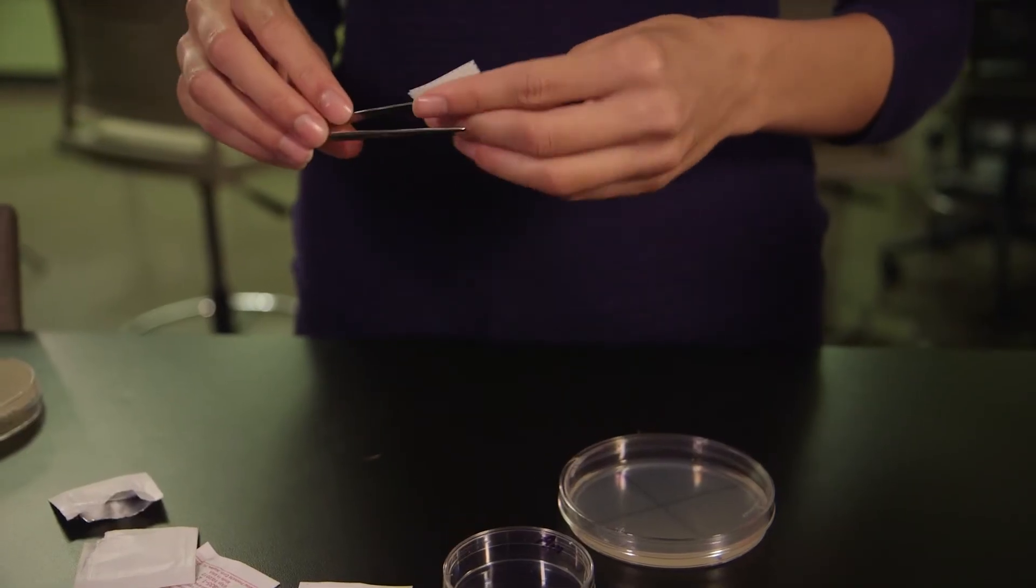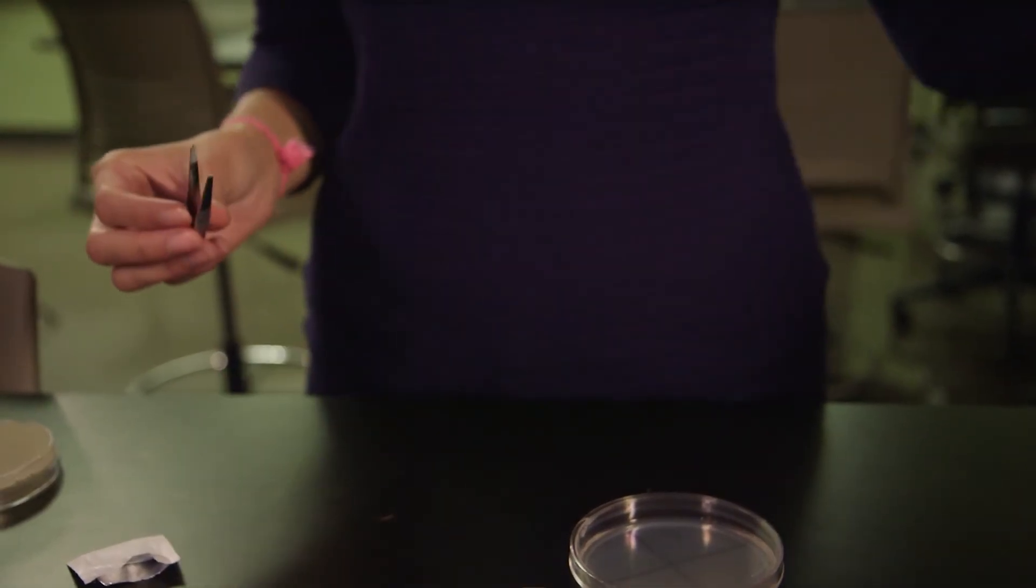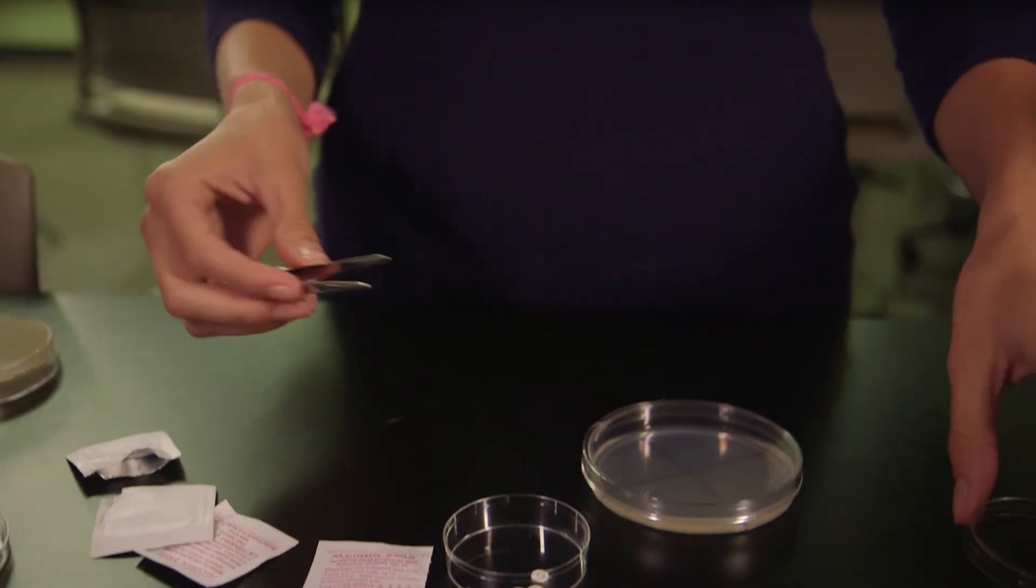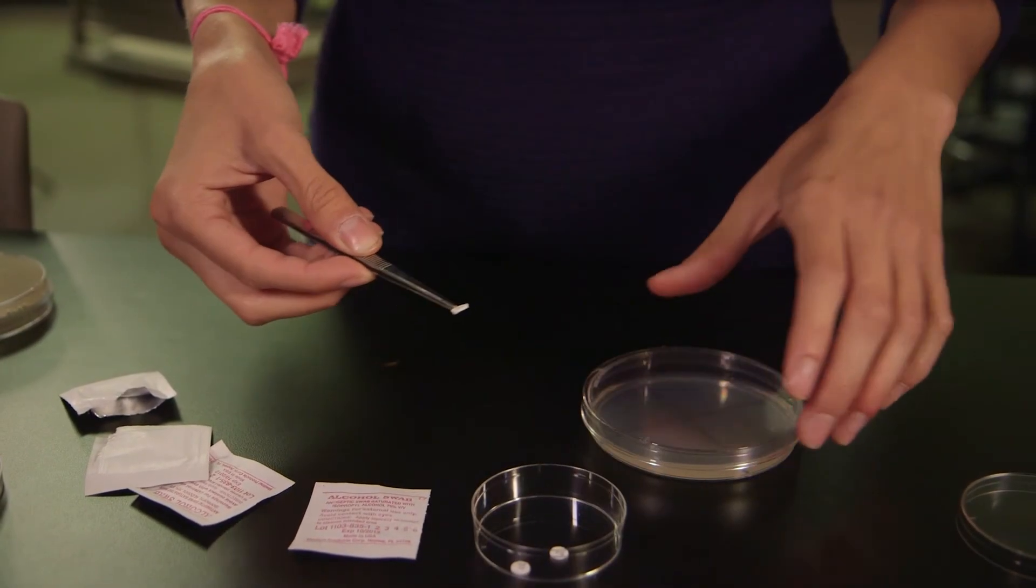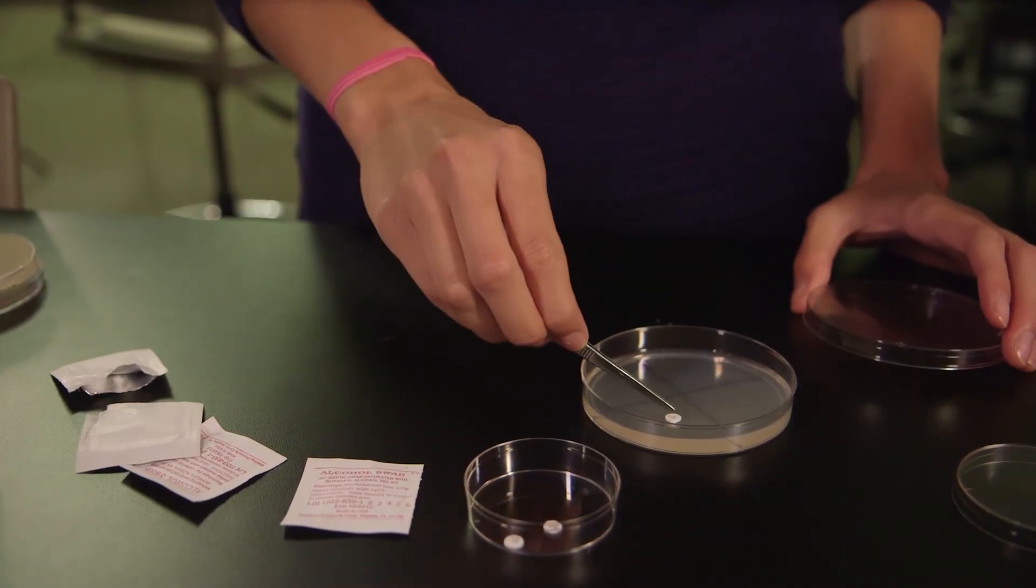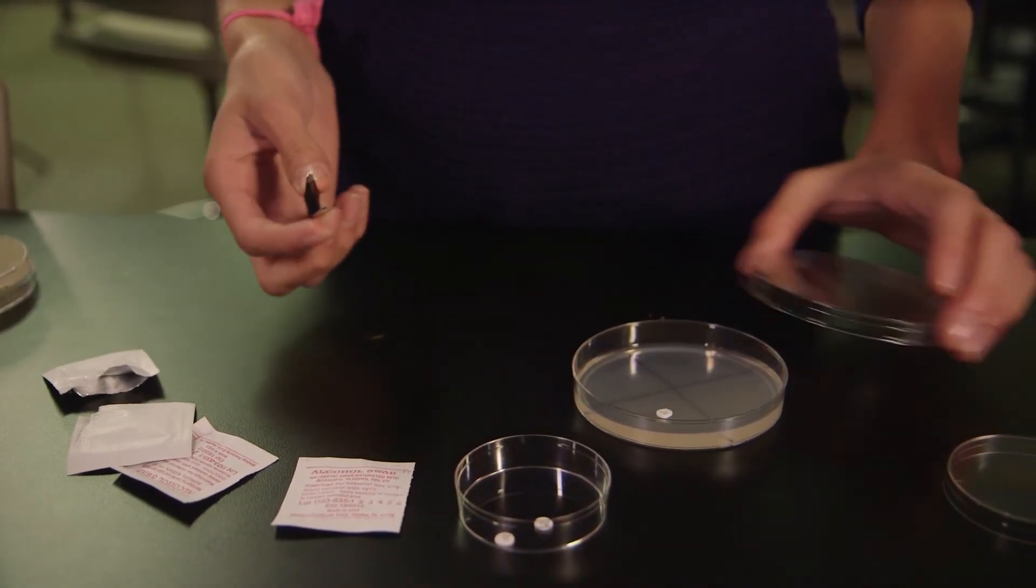You will place one of each of these discs using forceps on the surface of the agar. First, sterilize the forceps using an alcohol pad. Then, open the small petri dish, remove one of the discs, and place it on the surface of the agar in the middle of one of the quadrants. In order to prevent the disc from falling off of the agar, gently press each one so that it sticks on the agar.